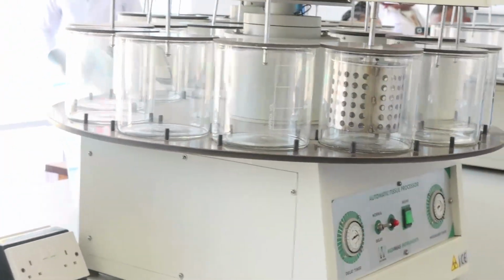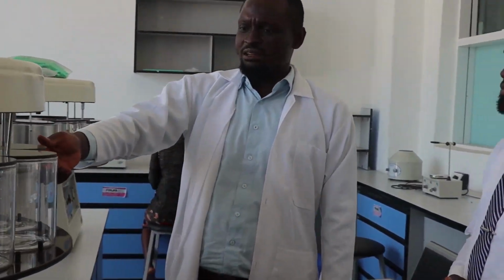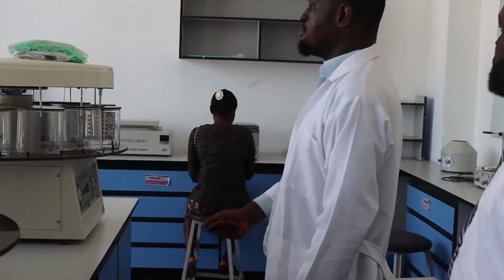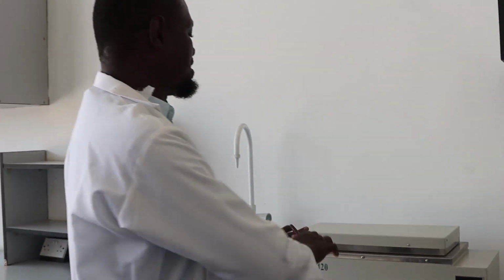This is where we process tissues. When we get tissues from the mortuary, or when somebody has breast cancer, we can check whether there is evidence of malignancy or whether it is benign. This is an automatic tissue processing machine. When we get a sample from the mortuary, or maybe when somebody has cervical cancer, we collect those samples and put them in our automatic tissue processing machine. After processing, we put the tissue in a thermostat water bath, embedded in paraffin wax. So now it is spreading, so that we can spread it on the slide for viewing.